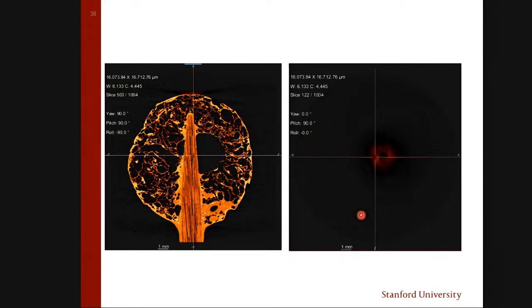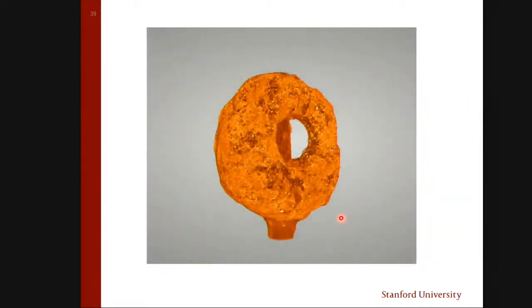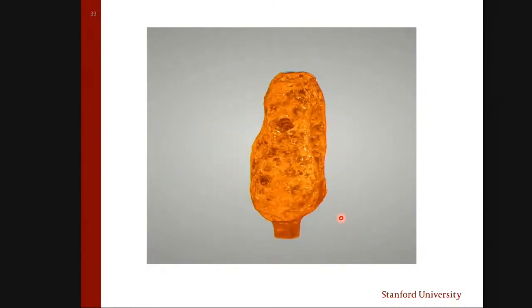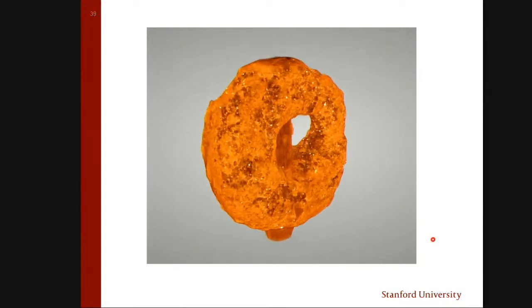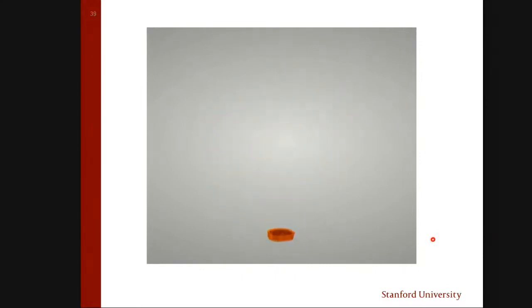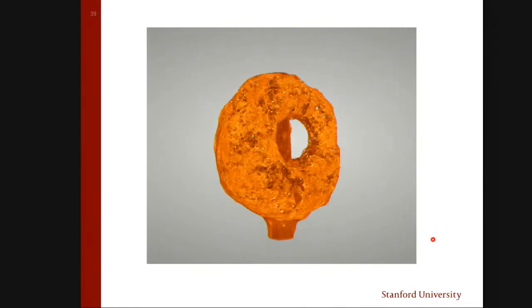Now, if you want to play around with the 3D reconstructed and rendered image, you can do that as well. So you can get this Cheerio, for example, in 3D, and you can do a movie around. And not only that, you can actually slice it in the three-dimensional image and also see something like that. So definitely this is very visual, very cool, and everybody likes it.